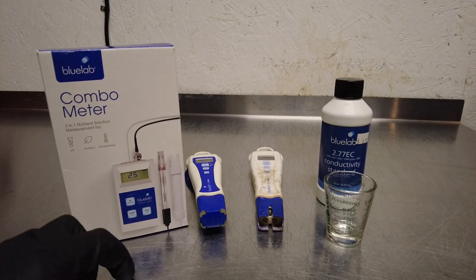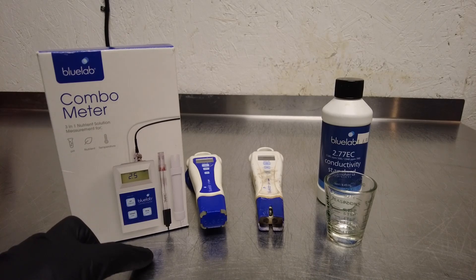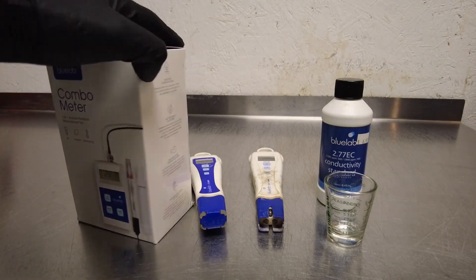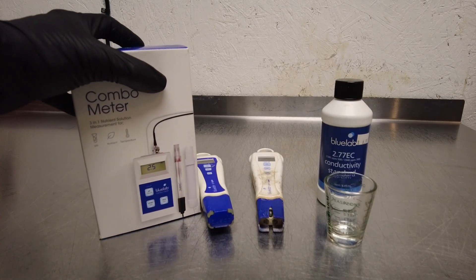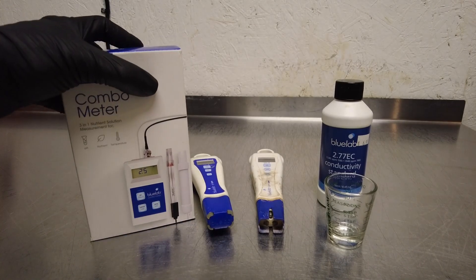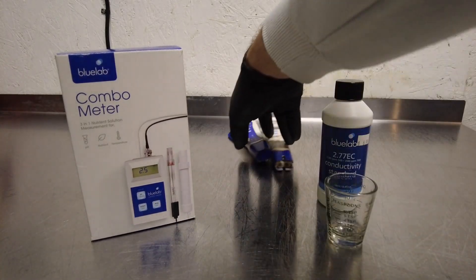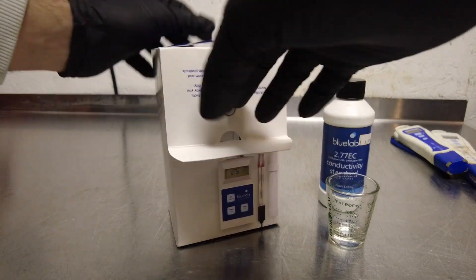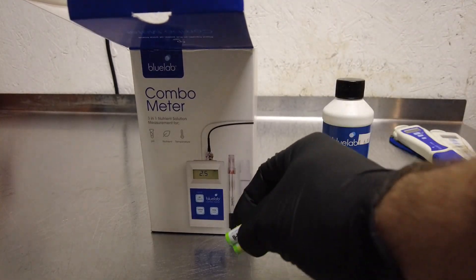I've decided to go ahead and grab this combo meter, which has not only the pH probe but also the EC probe, which includes temperature as well. I thought this was more of a wall-mounted unit but I realized it's really a handheld device — something you can walk around with and check your res with one meter rather than two.